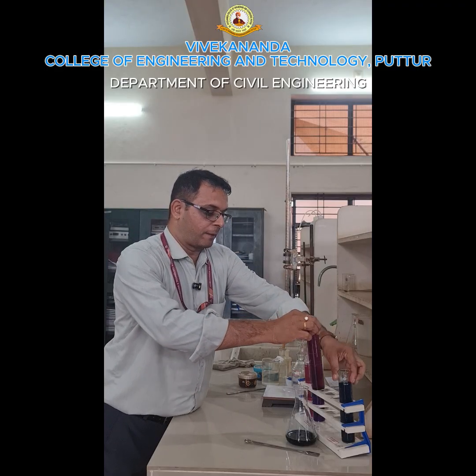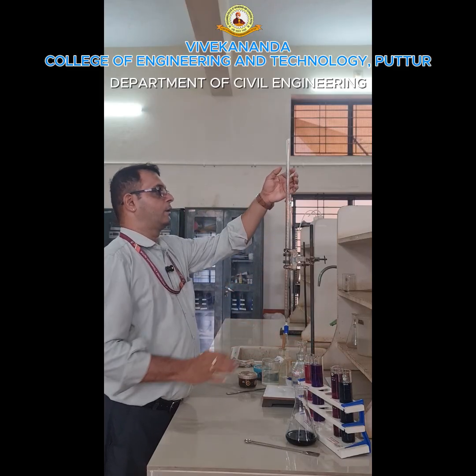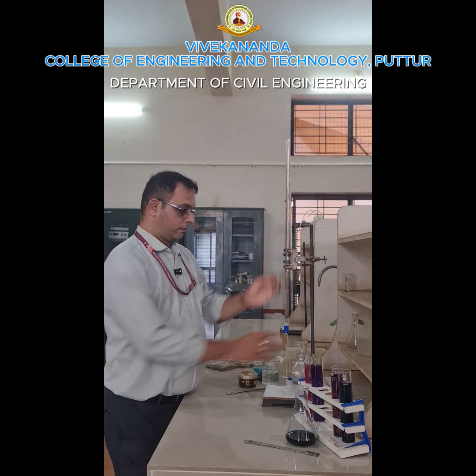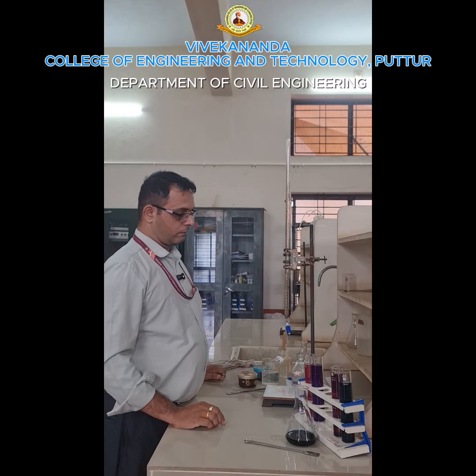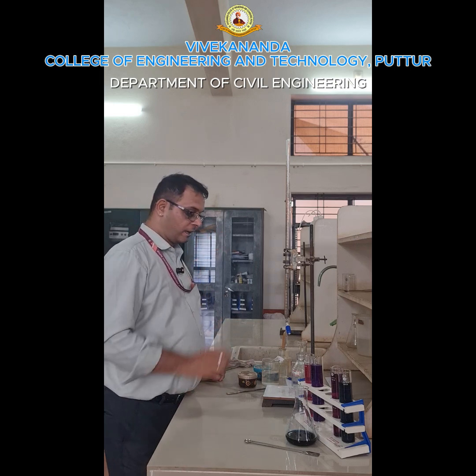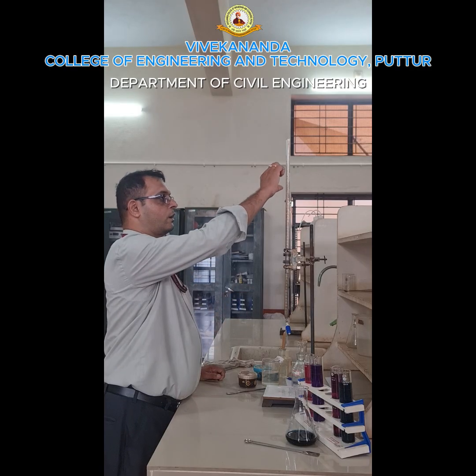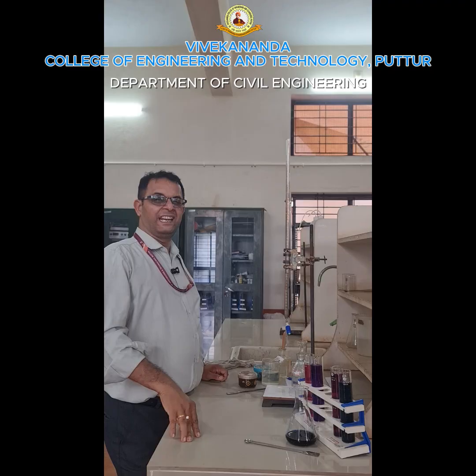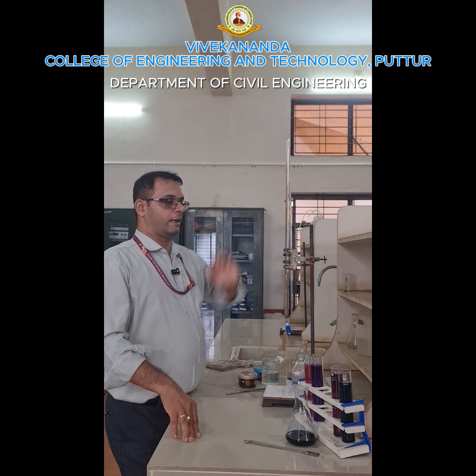Before starting the experiment, what do I have to do? I have to note down the initial reading. I have taken it as 0. Now what is the reading? I have to take the final reading minus the initial reading. Afterwards, I have to note down the total amount of EDTA consumed in this trial.